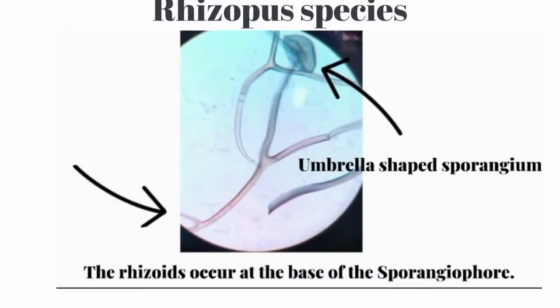Next one is Rhizopus. They have an umbrella-shaped sporangium. At the base of the sporangiophore, nodal rhizoids are present. Aseptate hyphae are also present.